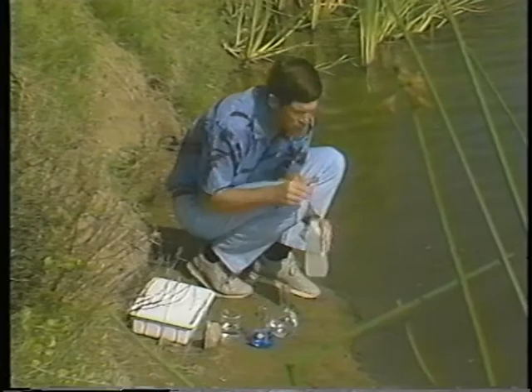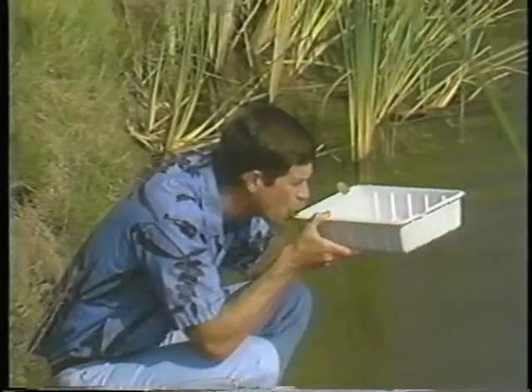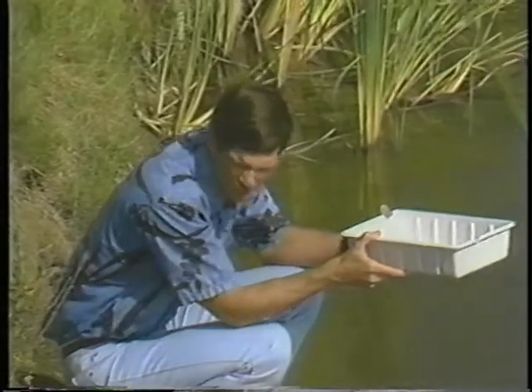Now, I bet a lot of you are thinking, what did you do when your teeth started sizzling? Well, here's another rule you have to remember. If you ever get acids or bases on your skin or your clothes, you need to flood the area with lots of water. Unfortunately, at the time, I was working near a lagoon, and the only water nearby was salt water. It was lagoon water, and I had to rinse my mouth out with that. Then I raced to the nearest store and drank some milk.